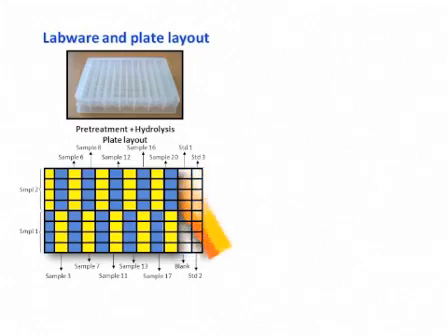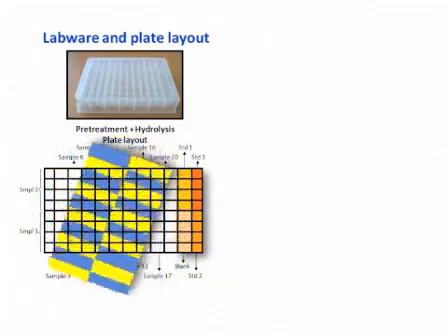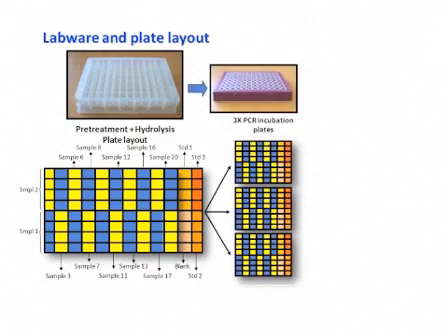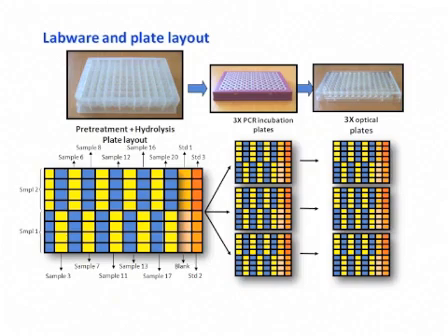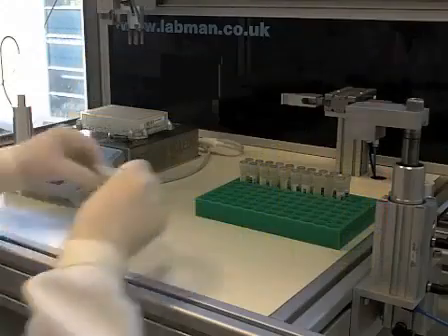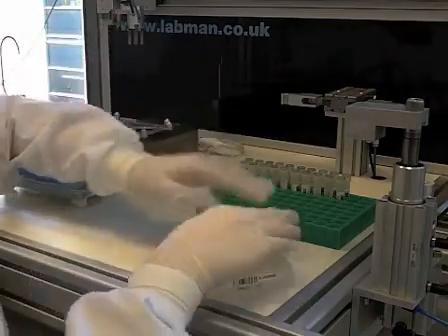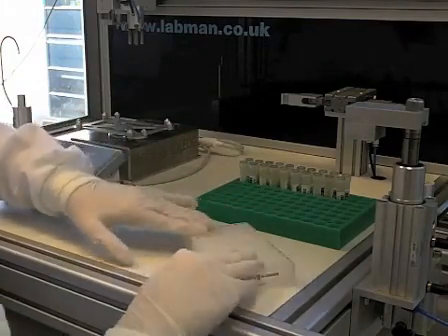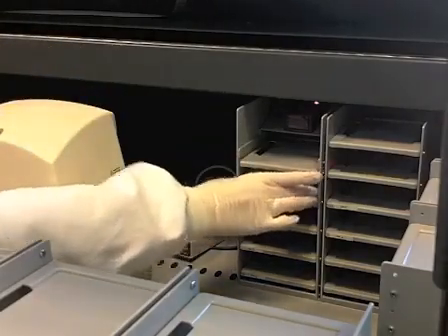The biomass is dispensed into 10 columns of the plate, leaving 2 columns for standards. By doing 4 repetitions per sample, we load 20 samples per plate. The hydrolysate of this plate will be triplicated into PCR plates, resulting in 3 optical plates. In this way, we have 3 determinations of reducing sugars per well of biomass. Once formatted, the plates are sealed with a silicone mat to avoid evaporation. When they are ready, they are moved to the liquid handling robot.